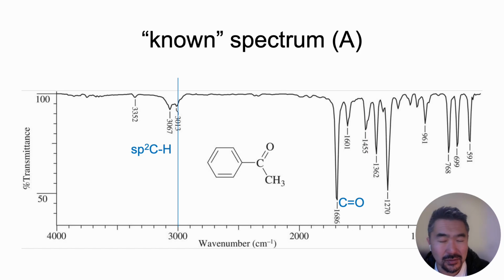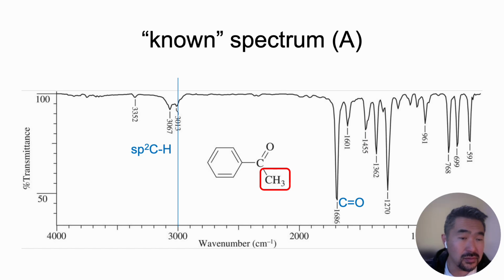One thing we forgot to do, we didn't draw a sharp line at 3000, so let's do that. Why? Because we do have sp3 CH bonds in this structure, so we should see that right before this 3000 line. Unfortunately, it's just this little blob. I don't know if you can see it, like in the shoulder of the other peak, there's an overlap.